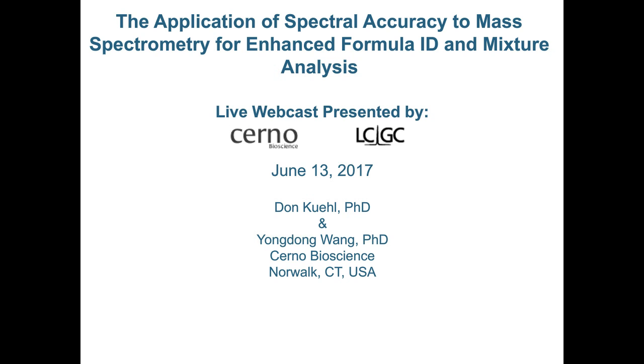This person asks, how can we attain spectral accuracy on a single quad, and what will be the limit as compared to using high-resolution mass spectrometry? You're always going to do better with high resolution.